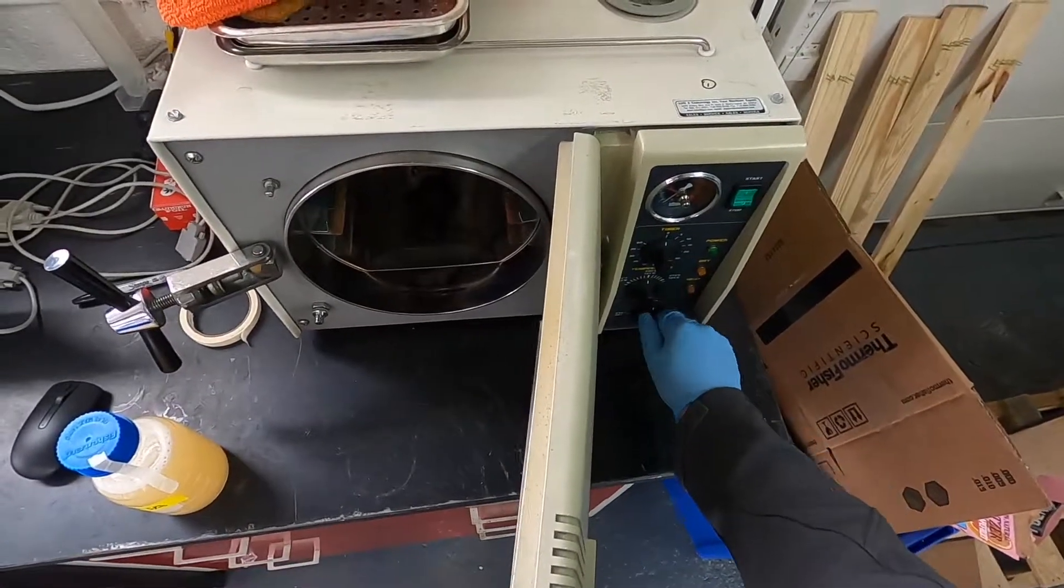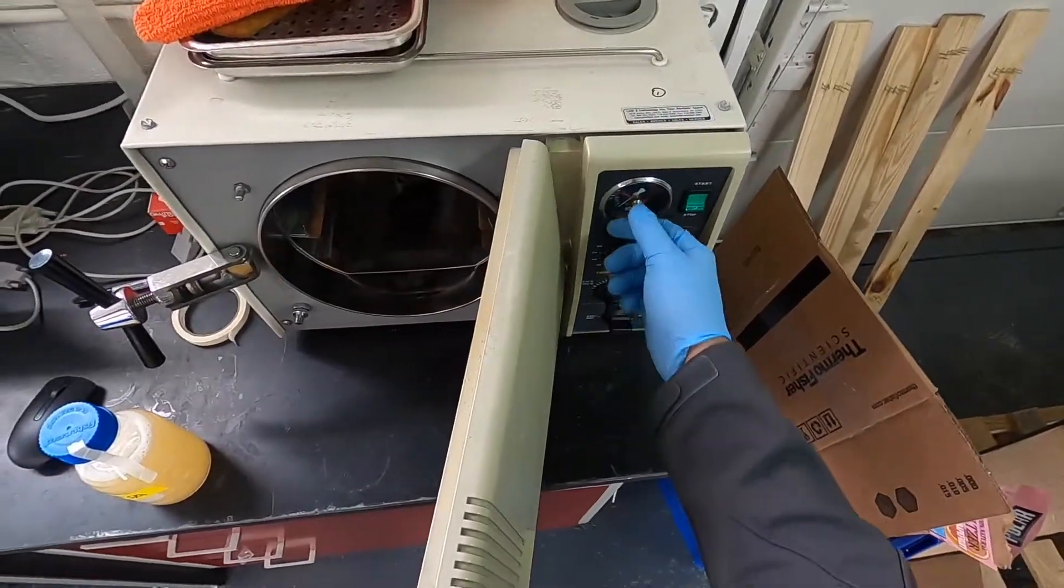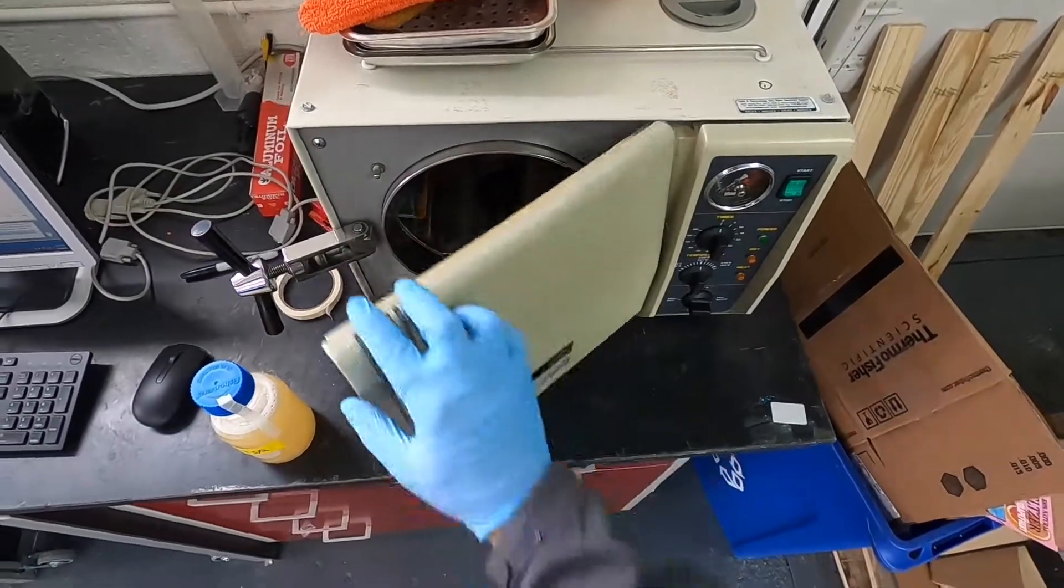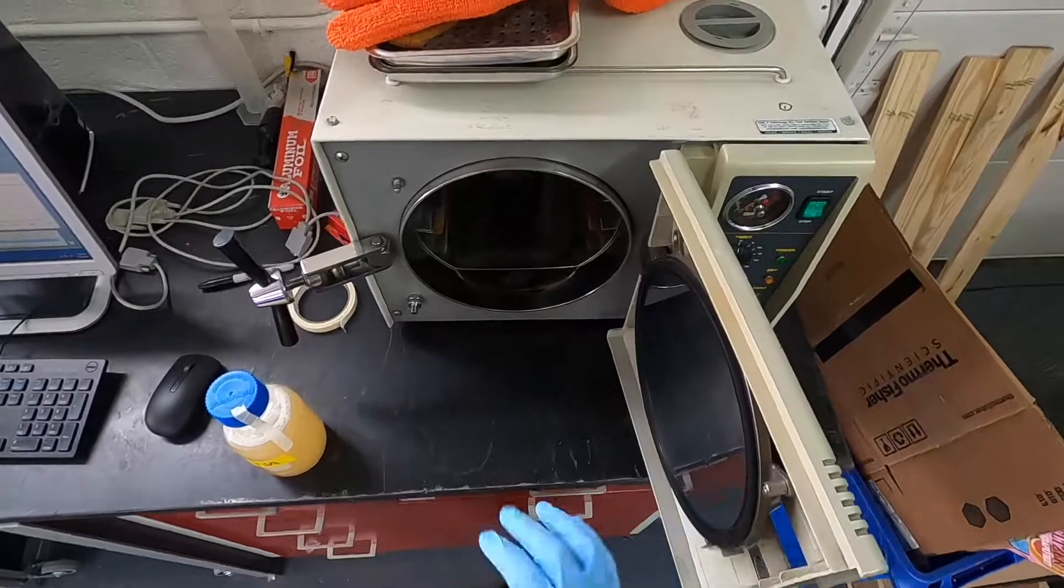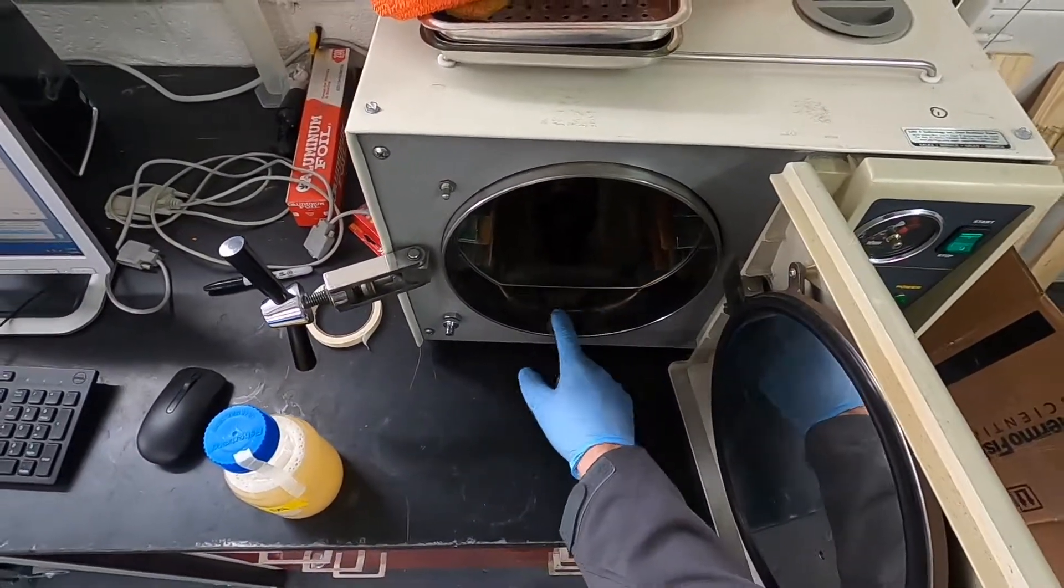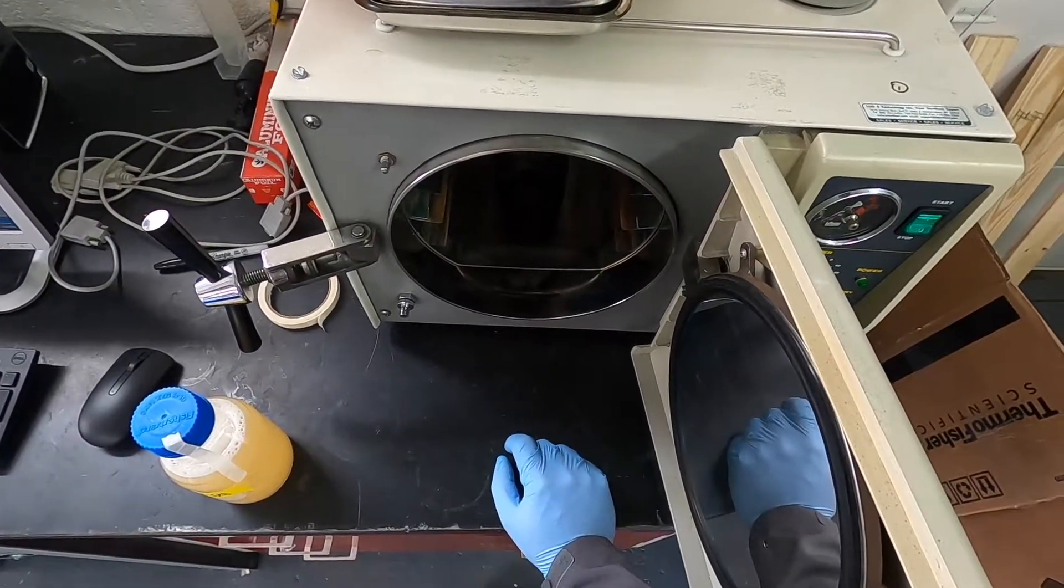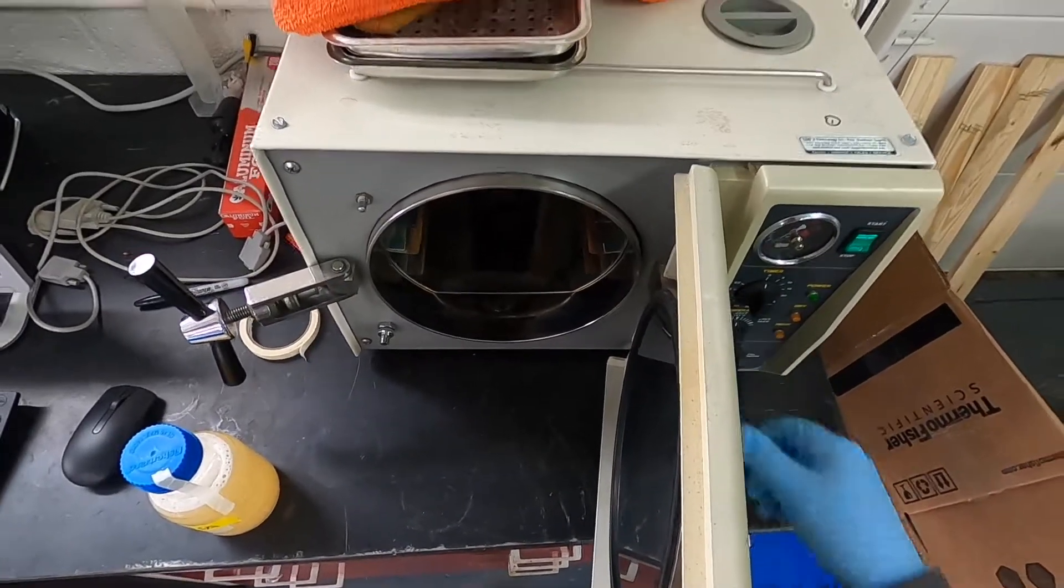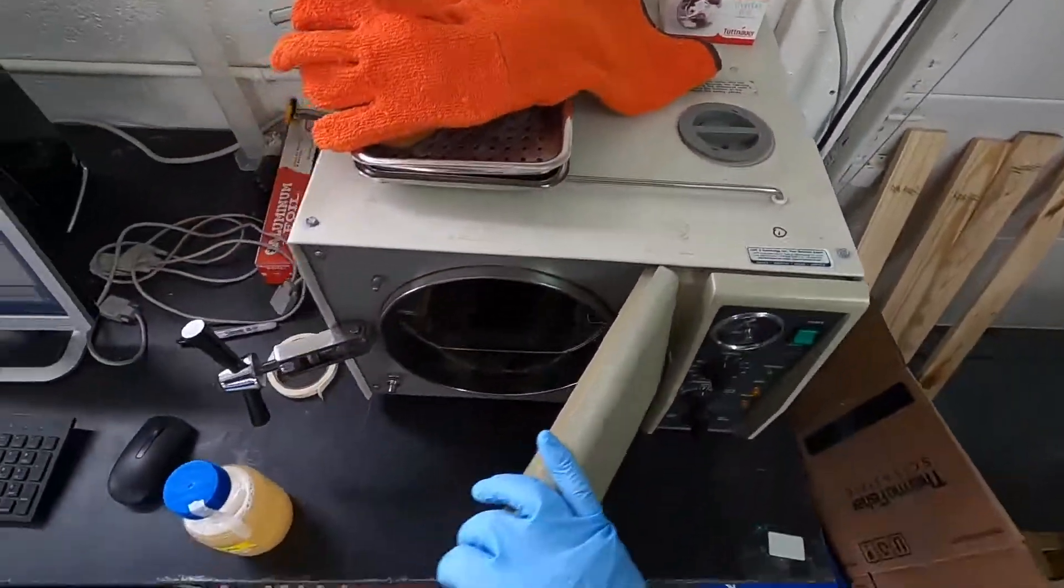This is an old school autoclave and it works awesome. So we fill this with water. This is an old Tuttnauer 2540M, for manual. Wait until the water comes out to this bevel here. This will fill the chamber with the water that will turn into steam. We'll stop this, we'll check the reservoir. That could use some water.